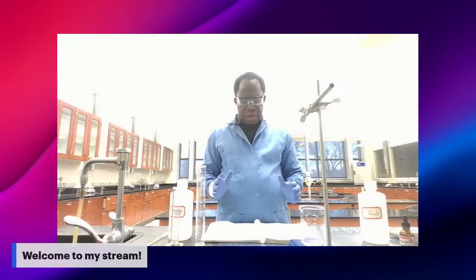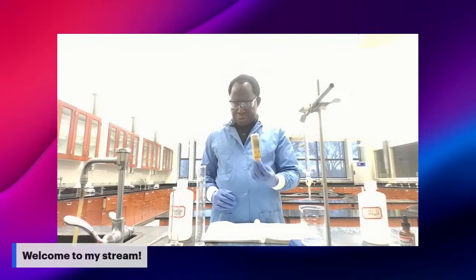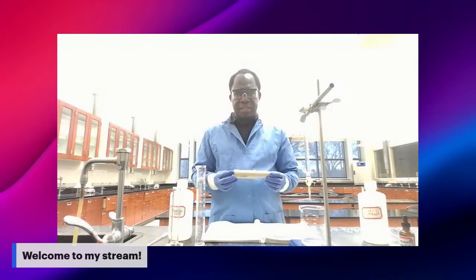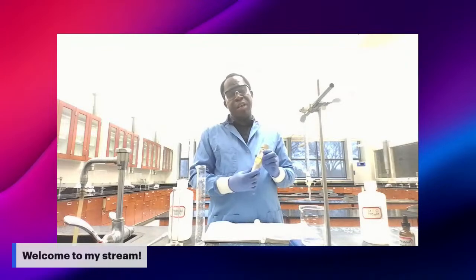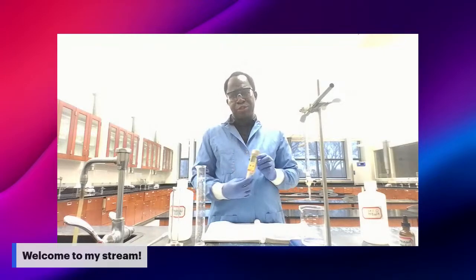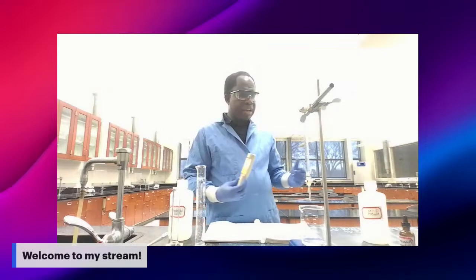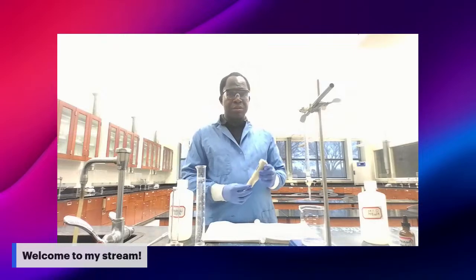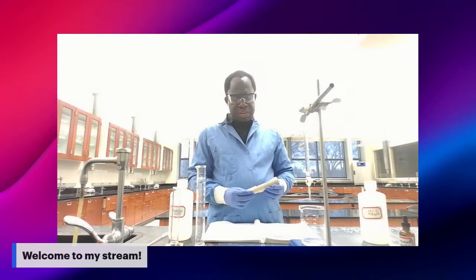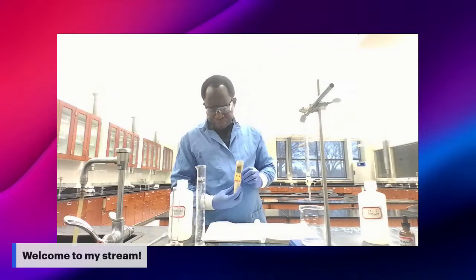Part two is the preparation of the pH meter. So in part two, they're asking you to calibrate your pH meter. It's already done. Usually we make sure that those things are already calibrated when you come to lab, but you still have to double check to make sure your pH meter is calibrated.